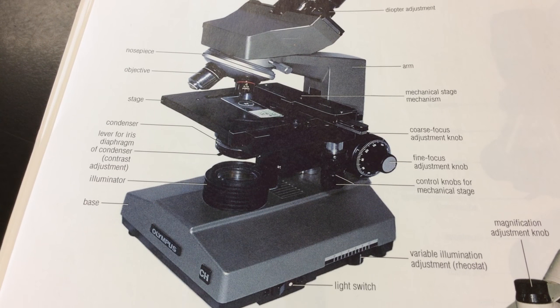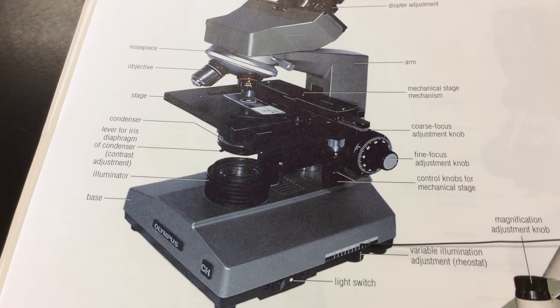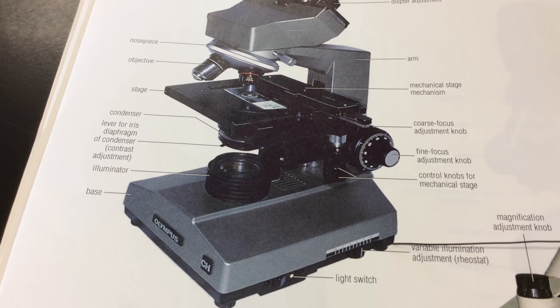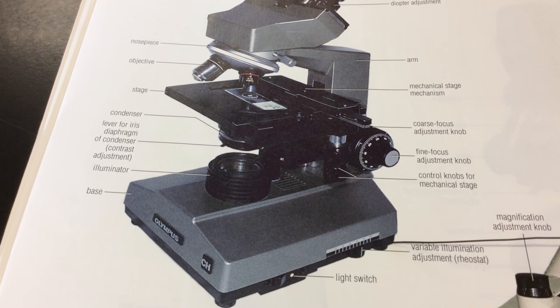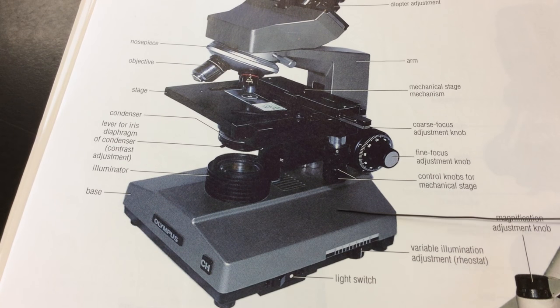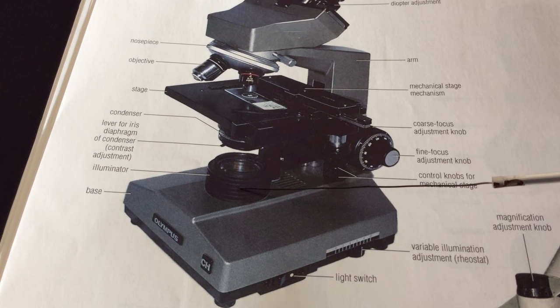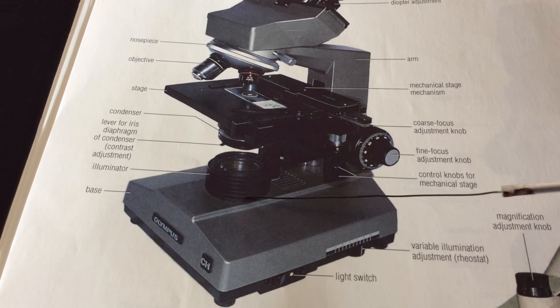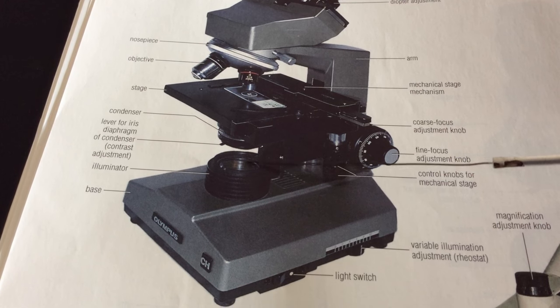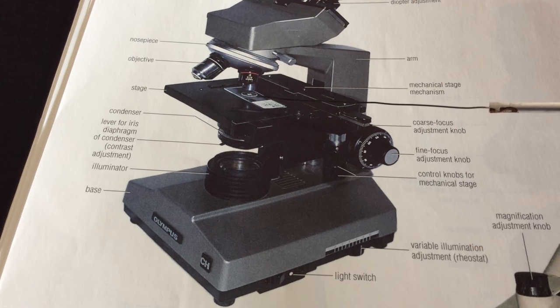So on the microscopes, we'll have a control, a rheostat, a variable illumination adjustment, so you can increase and decrease the intensity of light. We'll have an on-off light switch. The bottom portion here is called the base. The illuminator here is the pathway through which light from the light bulb in the base will exit and move up through the iris diaphragm and the substage condenser, and strike your specimen.